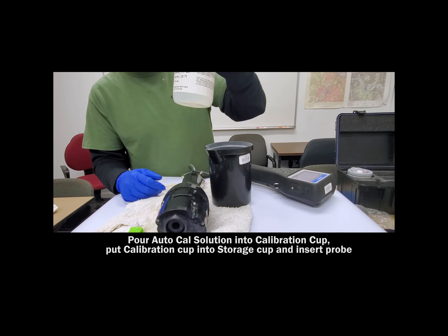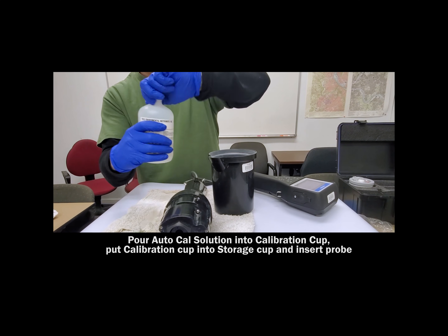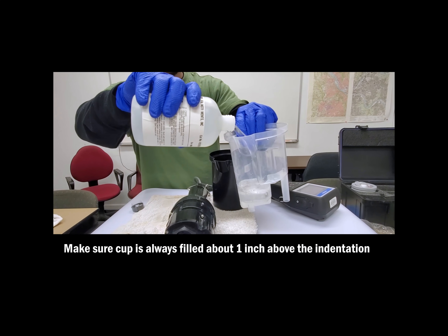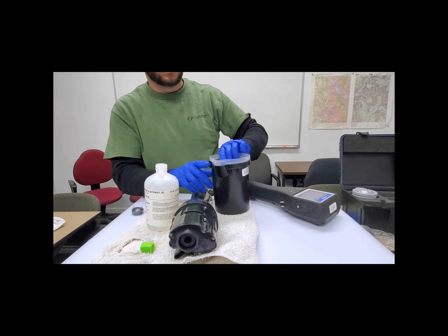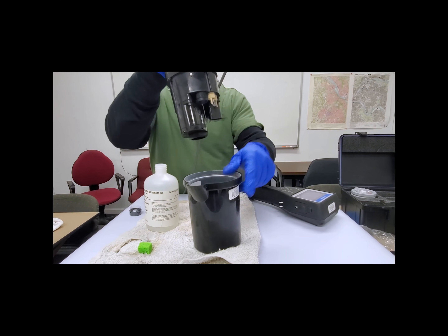Our first step is an auto-calibration. This is going to calibrate our temperature, our total dissolved solids, our conductivity, and our 0.0 baseline turbidity measurement. Pour your auto-cal solution into the calibration cup, and then put the calibration cup into the storage cup for excess. You always want to make sure that the cup is filled about one inch above the indentation, and then insert the probe. Solutions do expire, so make sure to double-check the dates before you calibrate any instrument.